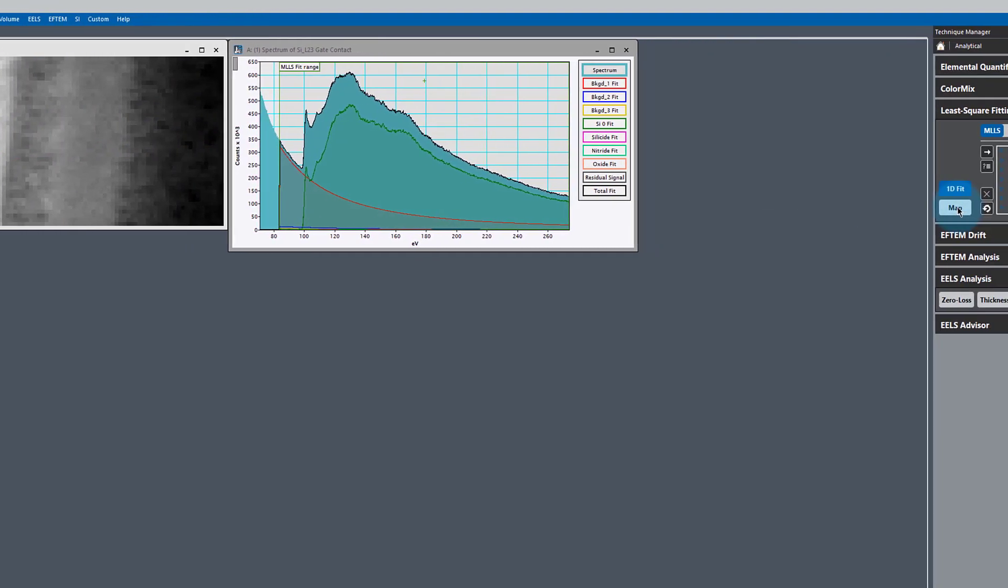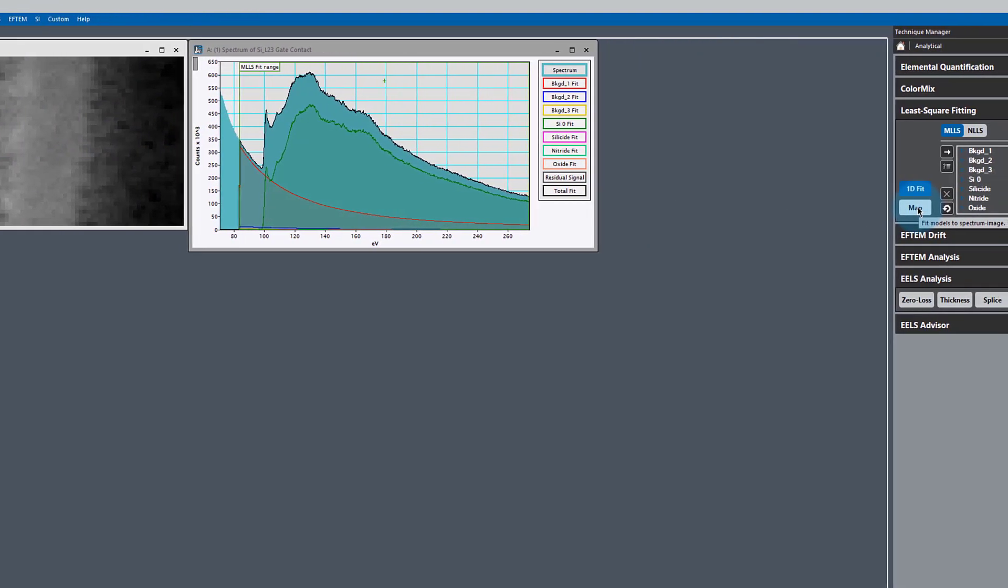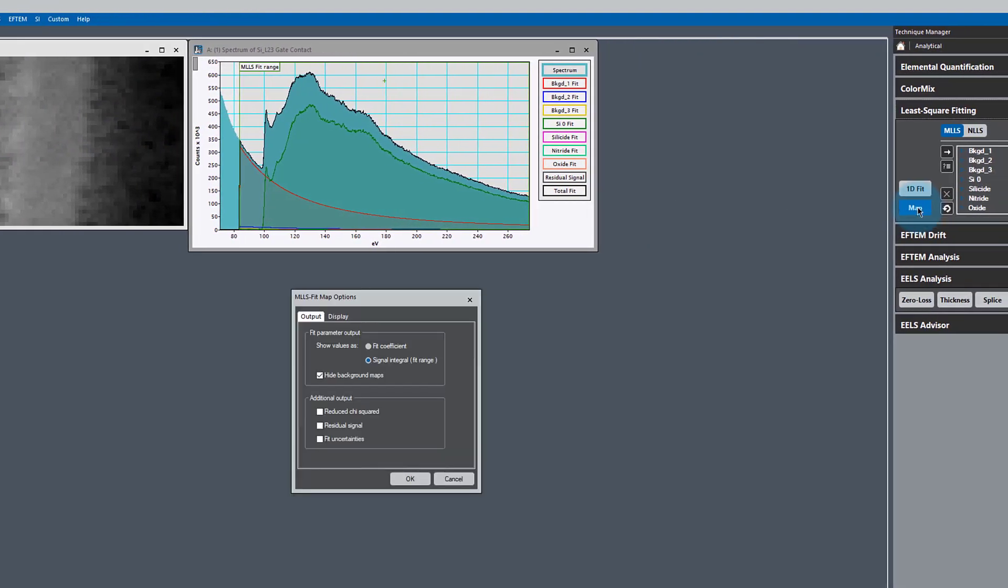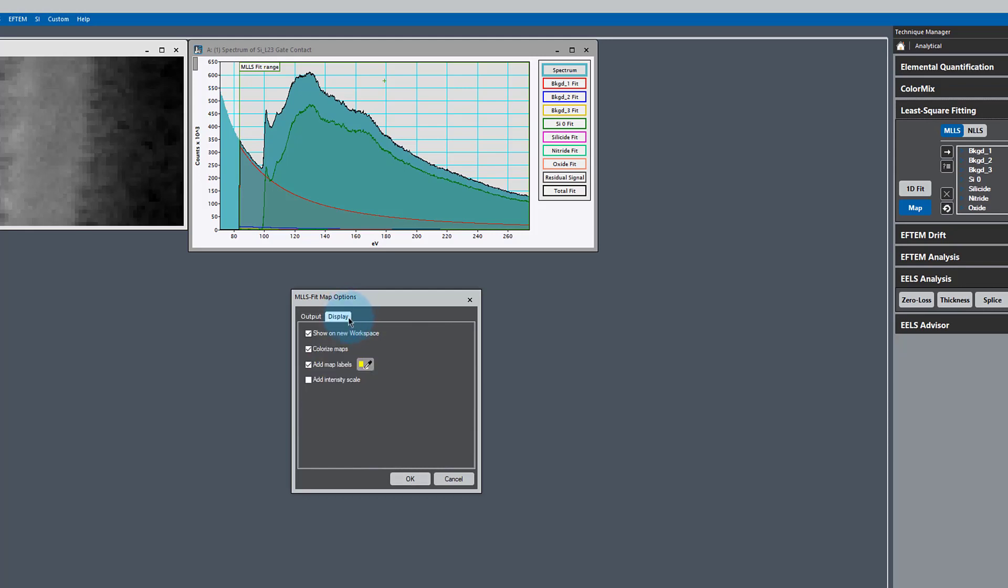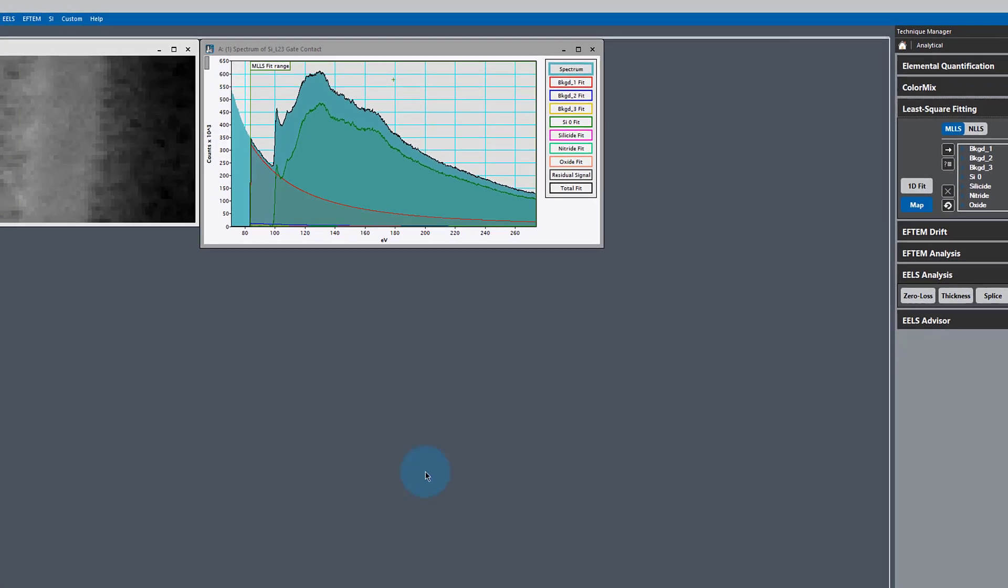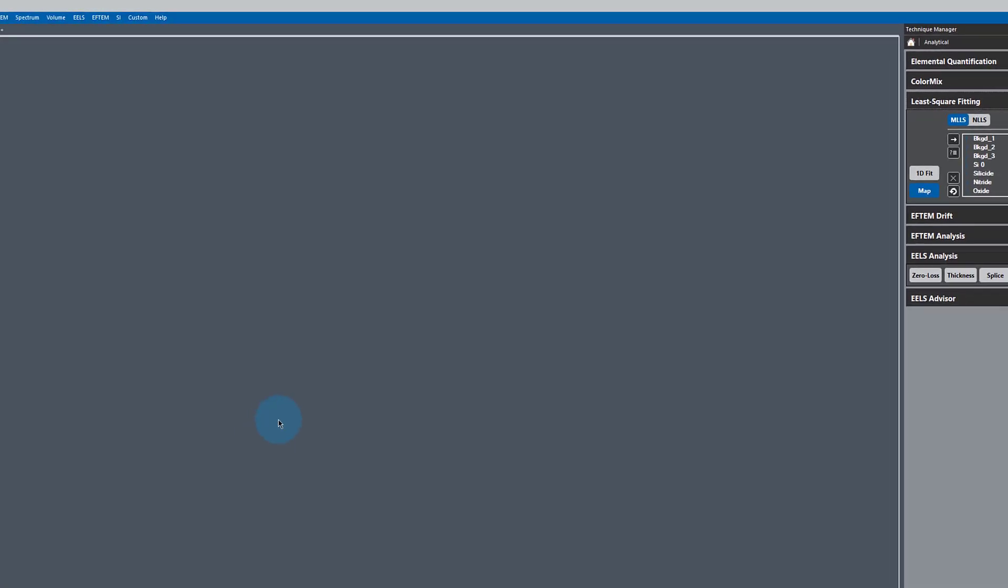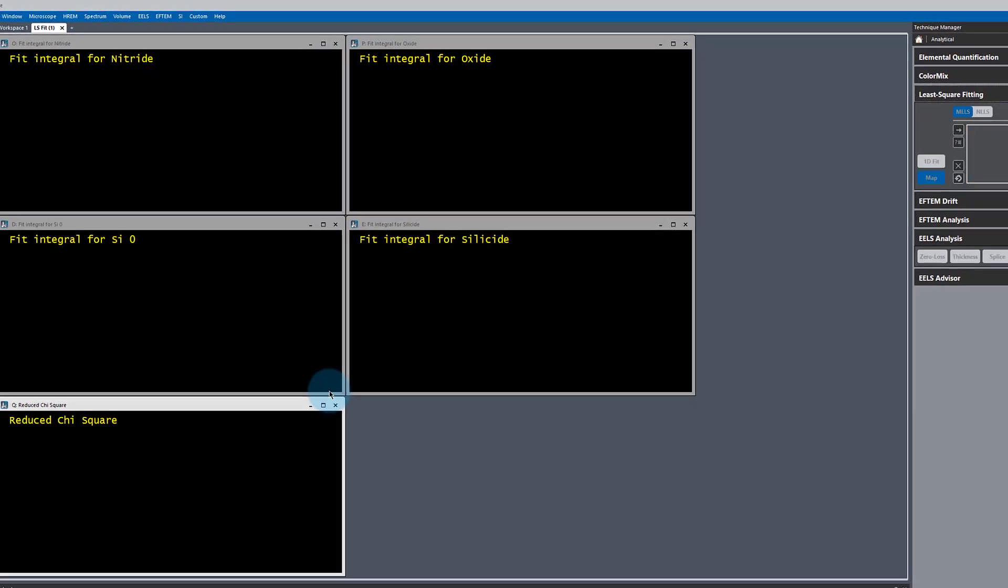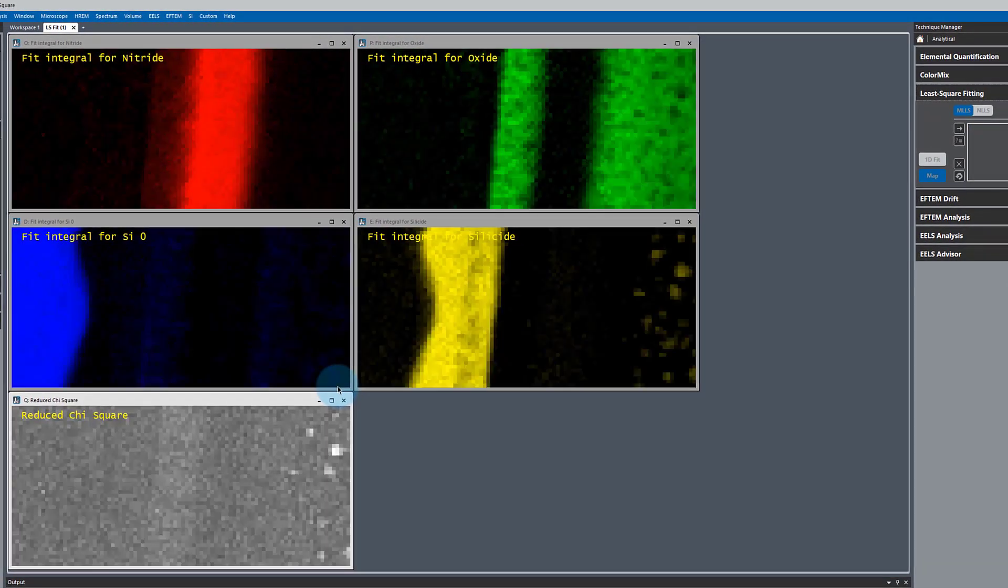I'm just going to hit the button that says map and we'll hide the background images so they don't tell us too much. But I really want to make sure I output the reduced chi-squared value. This will be very helpful for us. I'm going to display this on a new workspace. And here's our fit.